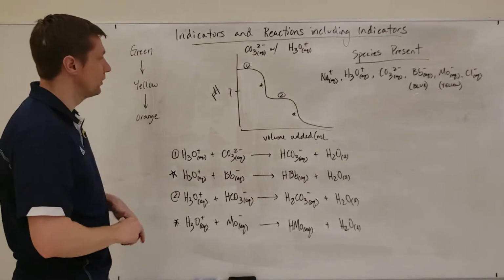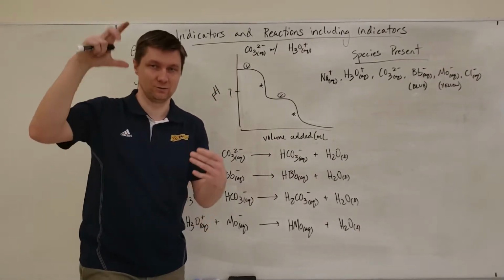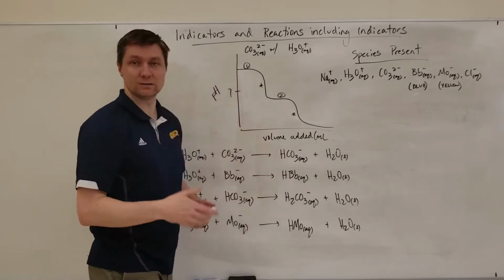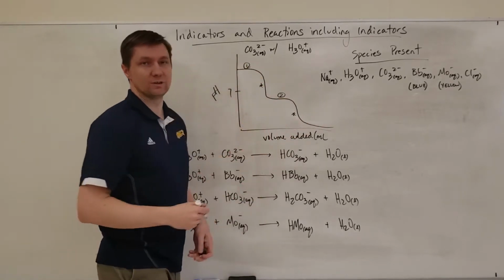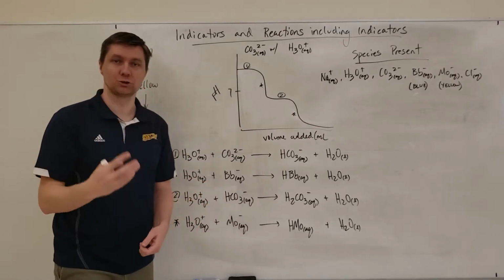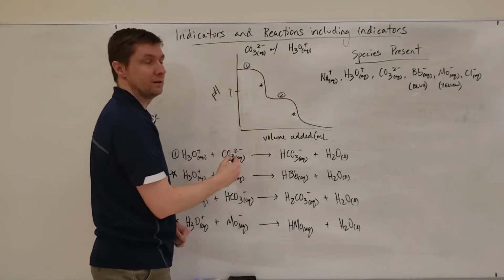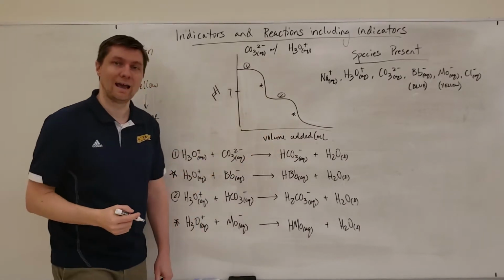All right, so that was just a really rough titration. I didn't use a burette or was precise with any measurements or anything like that. But as I was adding the hydronium ions, the acid, to the solution, I was basically rolling through this titration curve at a pretty quick pace. So there's four junctures that I've labeled on this titration curve that we passed. We've got this buffer region right here and this buffer region right here, and then we've got these two equivalence points that I've marked either with a star and an asterisk.